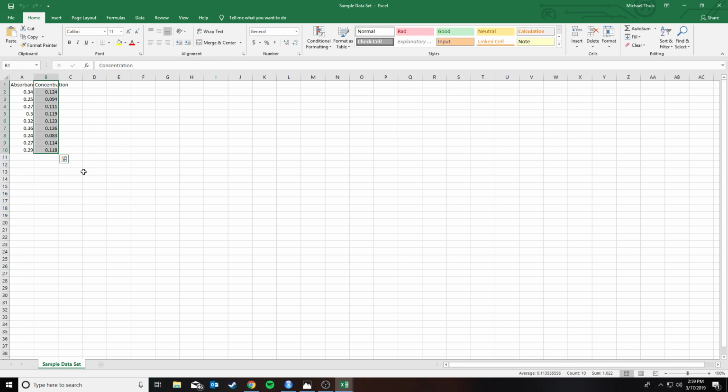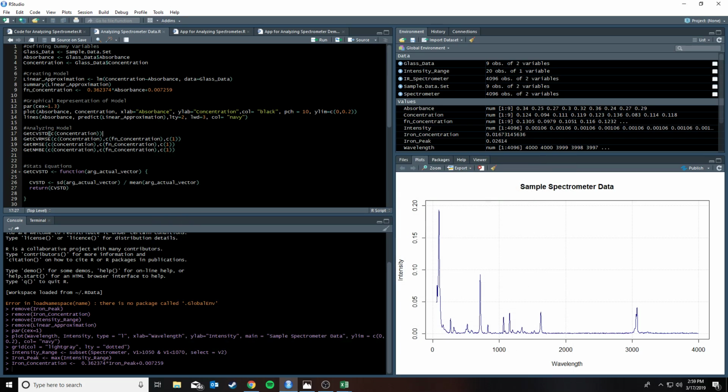What this will actually look like when we have our testing in and when that's all good to go is known concentration values and then the measured absorption. We're going to use that to create a linear approximation of Beer's law for our sample set and our testing procedures, and we'll use that to create the model. But since I'm just testing the model, this is really just made up data. So to do that, we have this linear approximation here.